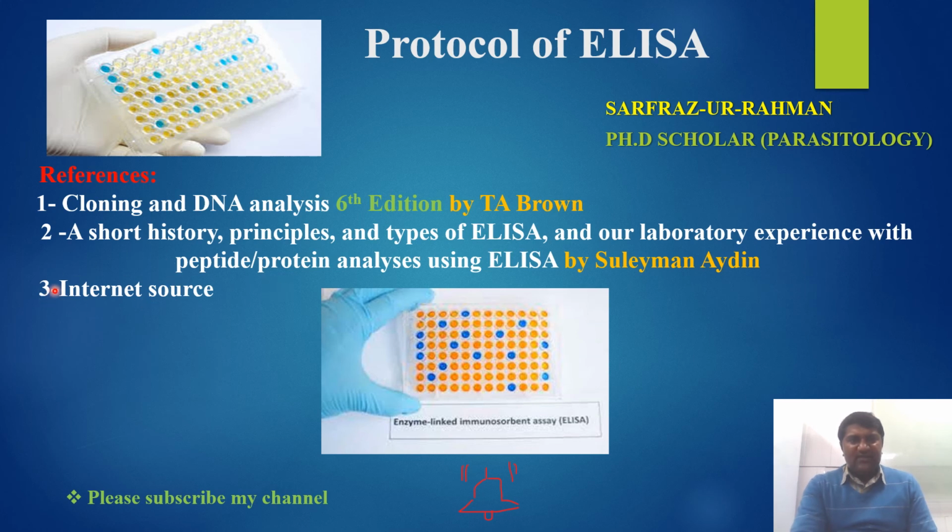The third one is the internet sources. You can see that this ELISA plate has two different colors that actually show the positive or negative sera, and similarly you can observe in this ELISA plate it also has two different colors which show the positive or negative sera.